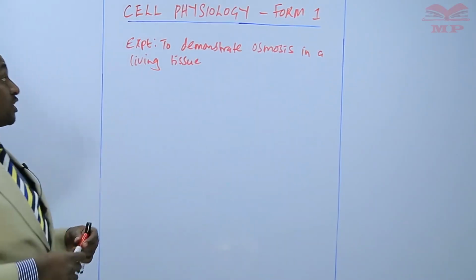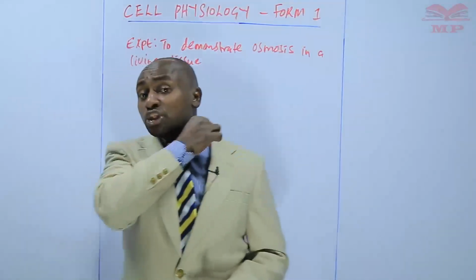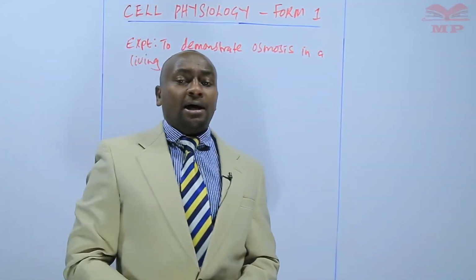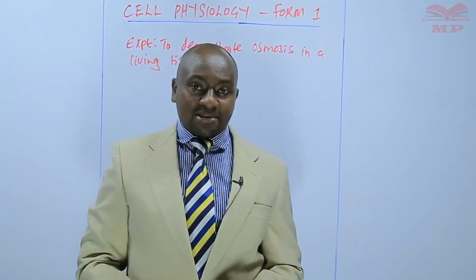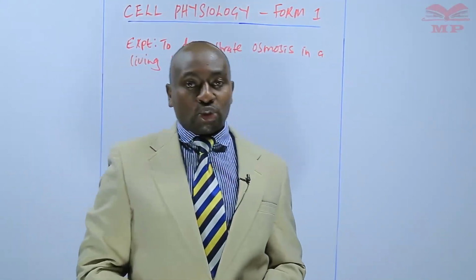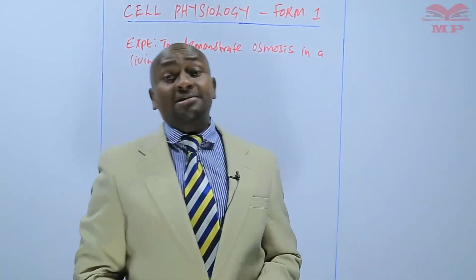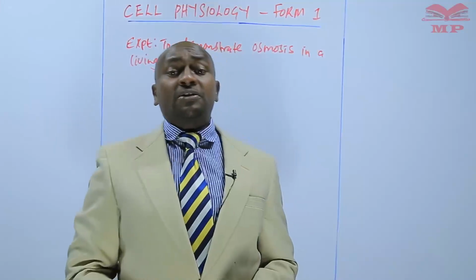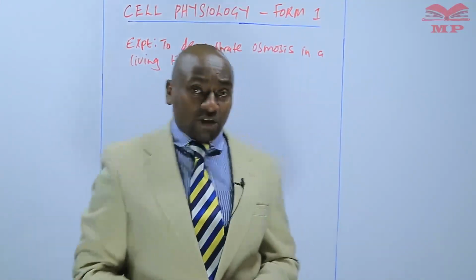The living tissue that we are going to use here is a plant tissue, and we will take some Irish potato tubers, and those ones will be representing our living tissue. Then we shall cut them to be of the same size, and place them in solutions of different concentration, and after that we'll make some observations.